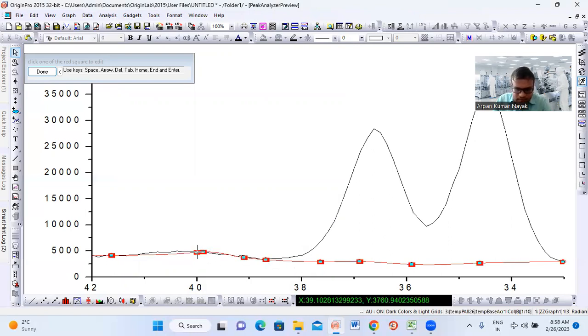And so now you can see it. So I can also adjust a little bit, yes. So now it was like you can see it. Based on your choice, you can modify the points.